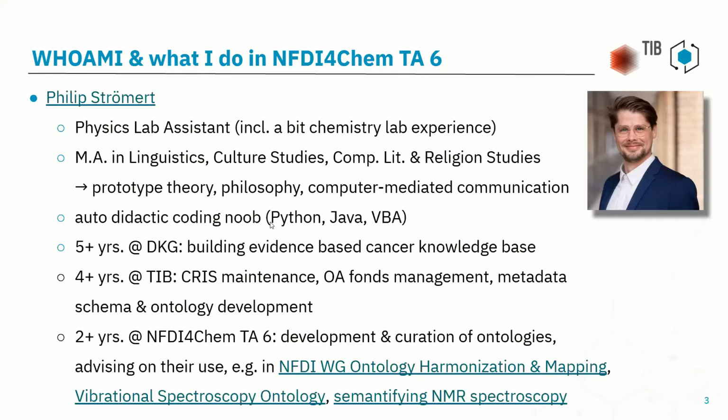And as part of that, I'm also part of the NFDI section metadata consortium working group called Ontology Harmonization and Mapping, where we try to do exactly that, harmonize the use of ontologies and the mapping between ontologies throughout the whole NFDI consortia. And currently I'm working also with other people from the NFDI4Chem consortium and external institutions on the vibrational spectroscopy ontology, and did some stuff for NMR spectroscopy.